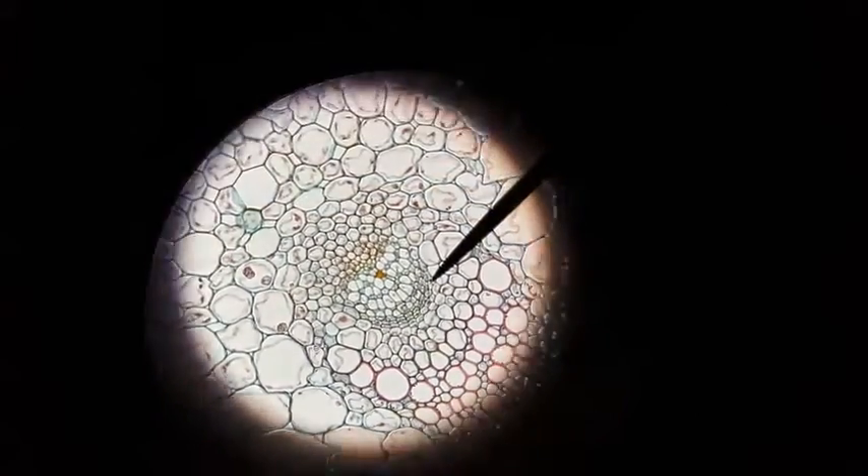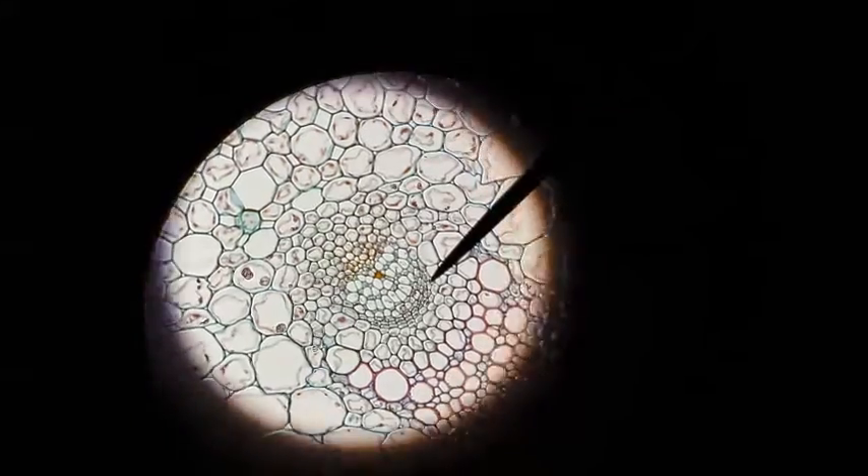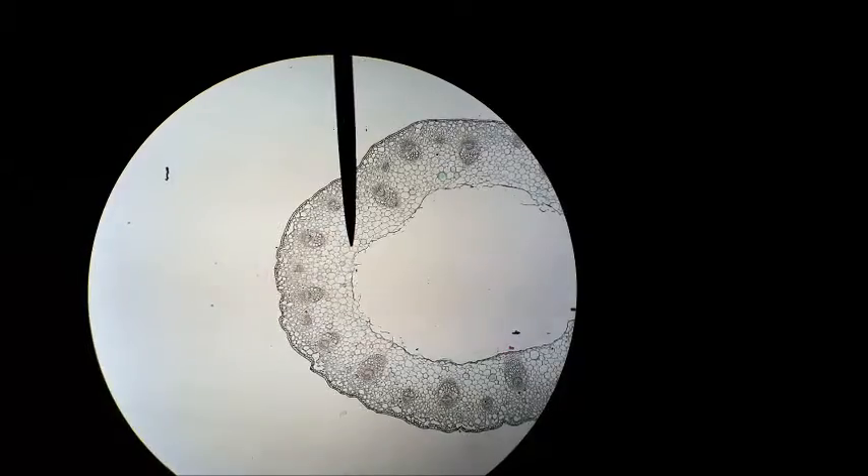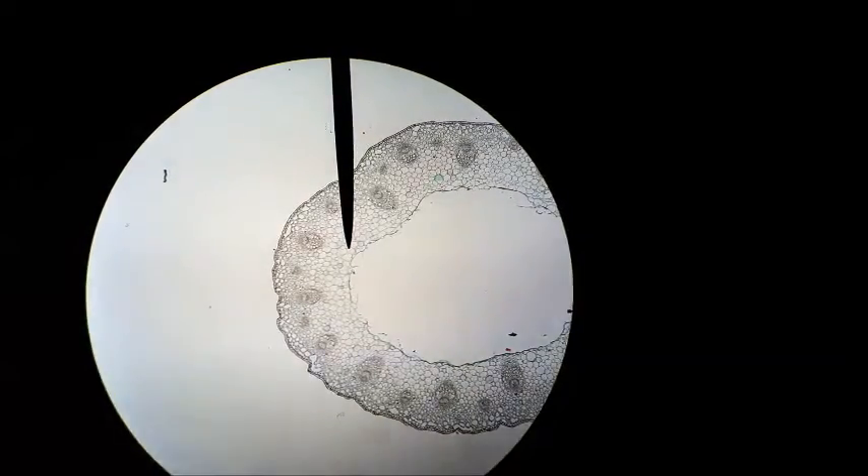We're suffering a little bit here because we don't really have a differential stain. The more central area of this herbaceous stem is pith or parenchyma.